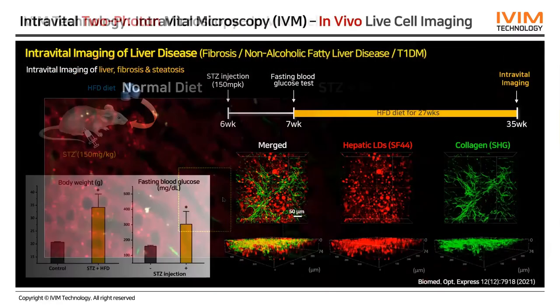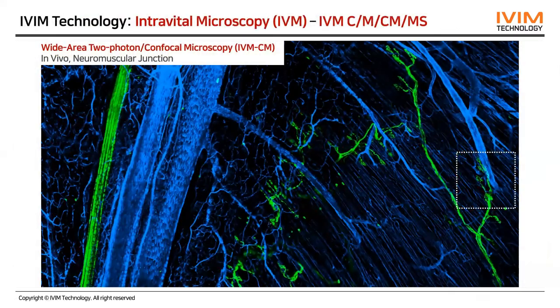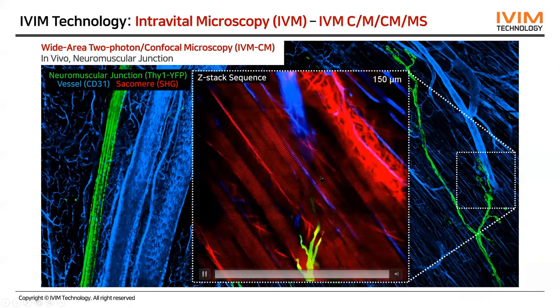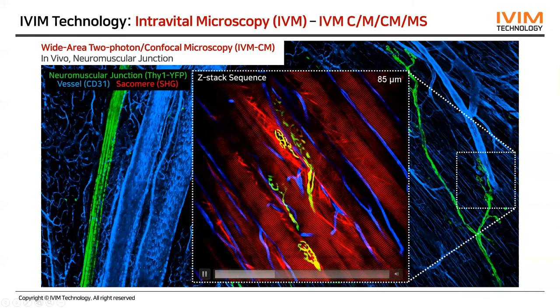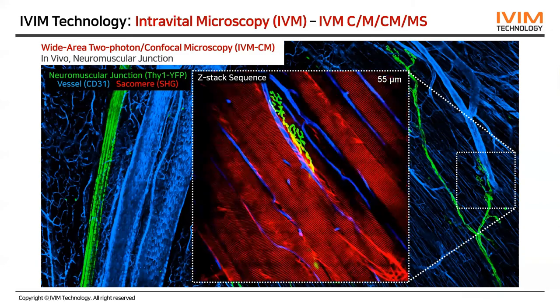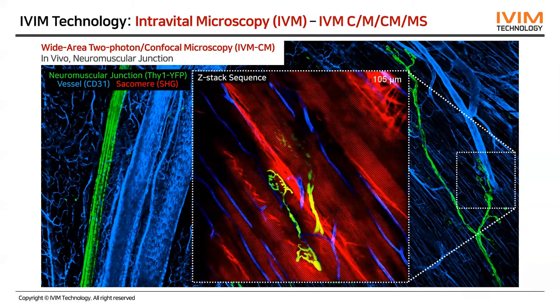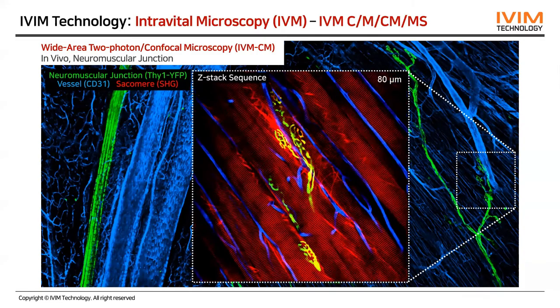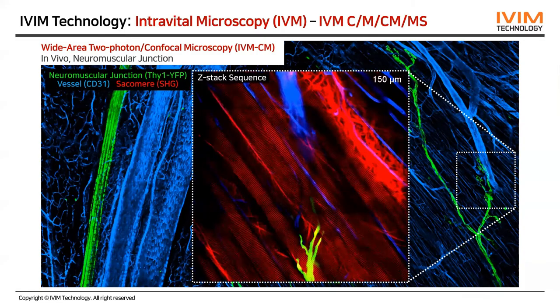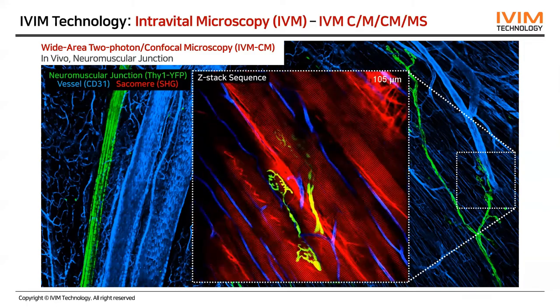And then this data in here, actually this is also single wavelength. This is a dual mode imaging mode. But with the 920 nanometer wavelength, I can tell you we can do second harmonic generation imaging, and then we can image the GFP, and then we can image the tdTomato or the DsRed. It is all at the same time with a single 920 nanometer wavelength.